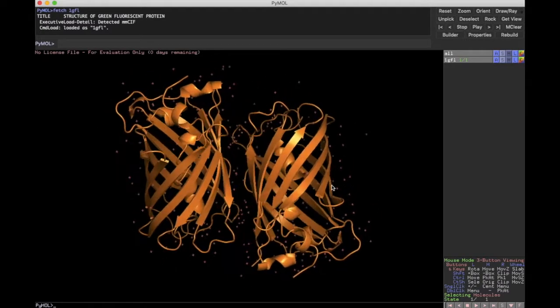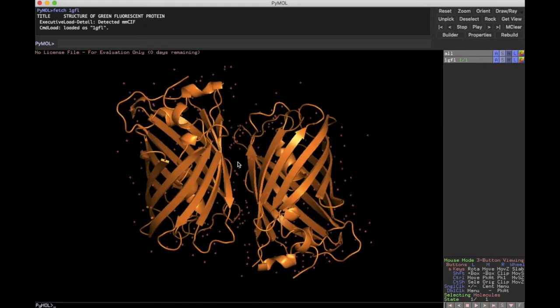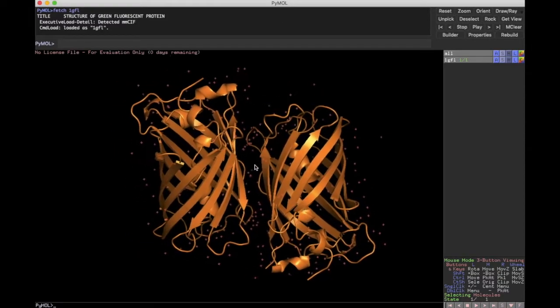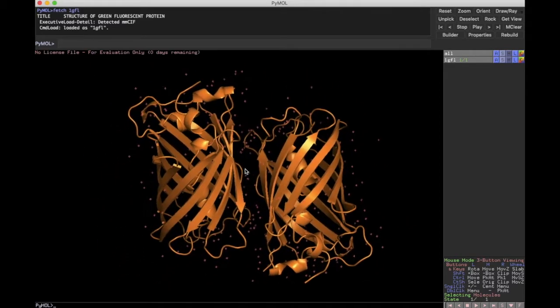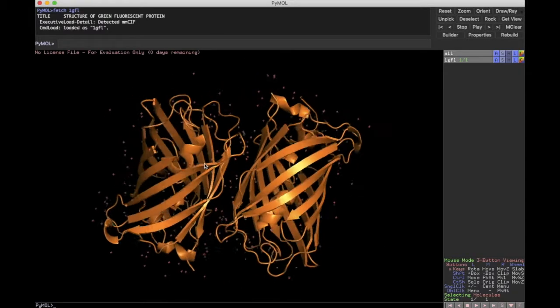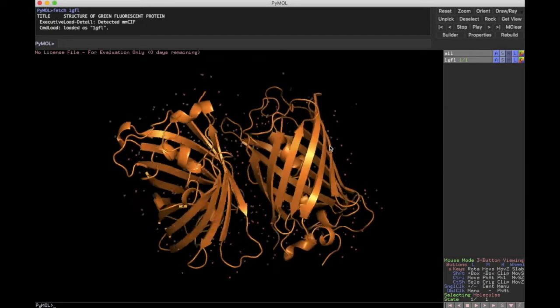On my computer, if I want to move these molecules left and right in space, I hold Option and then I can just click and drag back and forth. So that's how I do it. If you're using a 3-button mouse, you might simply be able to, let's say, click the middle button and move it around. But again, you'll just need to play around with your setup and figure out how it all works. Okay. Other than that, that's pretty much how you can zoom in, zoom out, and move the molecules around.